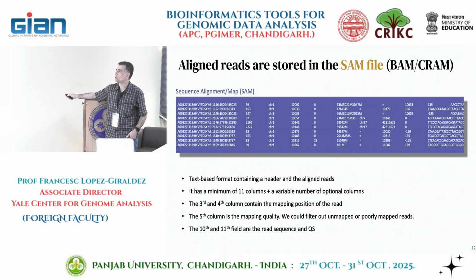This thing here is what we call the cigar string. It tells you how the read maps. It is quite convoluted, but if you look at the first one, M means matching, D means deletion. So you have 33 bases matching, 3 deleted, 21 matching, 3 deleted, 47 matching. And that should be the total length of the read. So a perfect match is this one, 101. Still, it probably maps in multiple places.